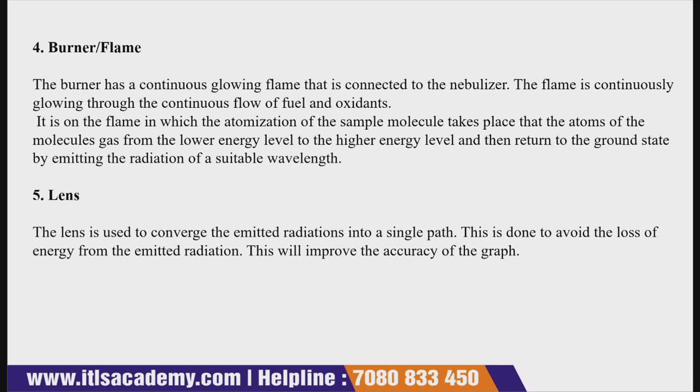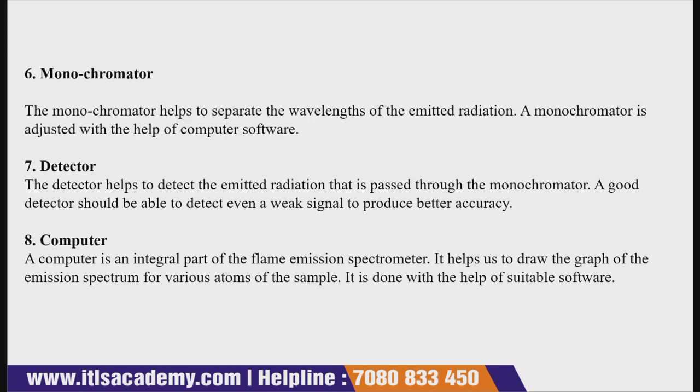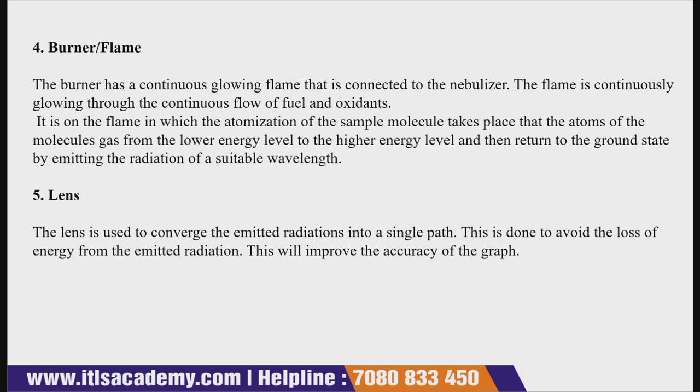Then they can ask you about the burner and flame, and what you understand by the monochromator, and what the work behind the monochromator is. They can ask you why lenses are used. How does the flame become very smooth, how does the flow of fuel become very smooth?